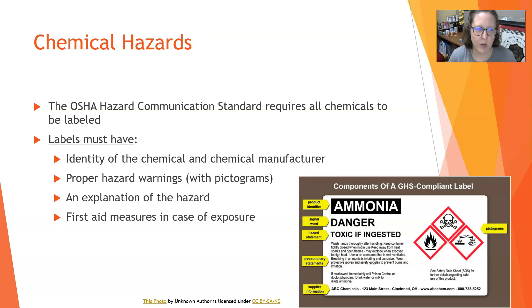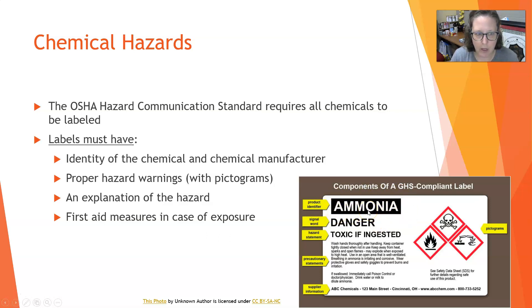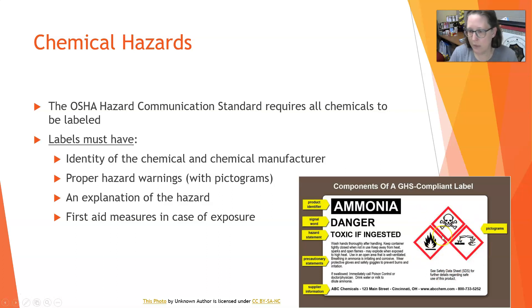Let's start with chemical hazards. The OSHA Hazard Communication Standard requires that all chemicals be labeled. The labels have to have the identity of the chemical and the chemical manufacturer, a proper hazard warning with pictograms. For example, it says 'Danger' as a signal word, and then it has a hazard statement — 'toxic if ingested' — and pictograms in case somebody who picks it up doesn't know how to read.